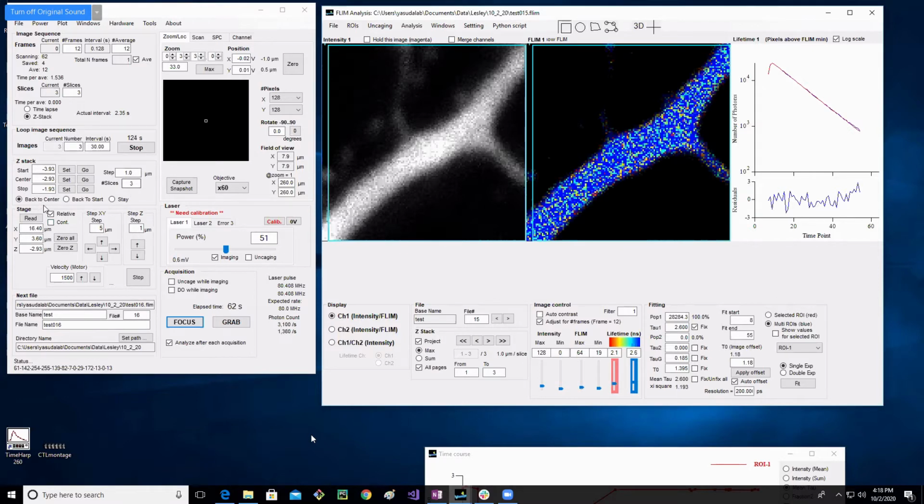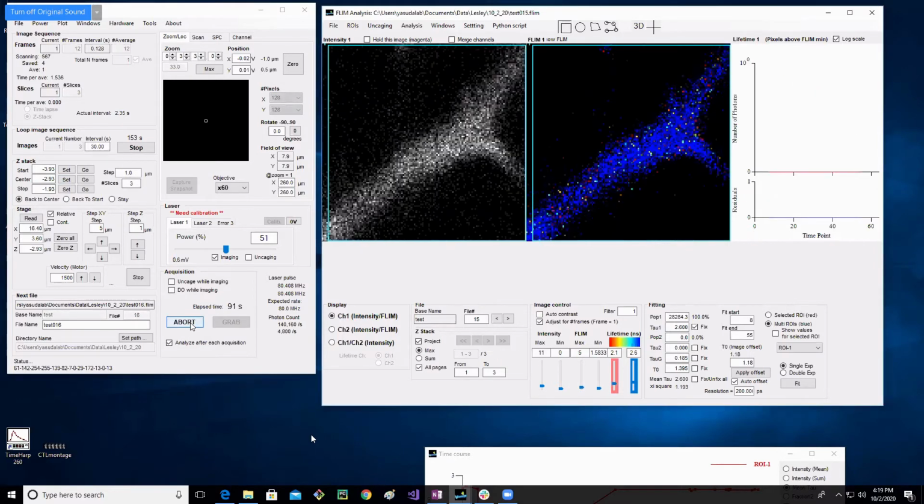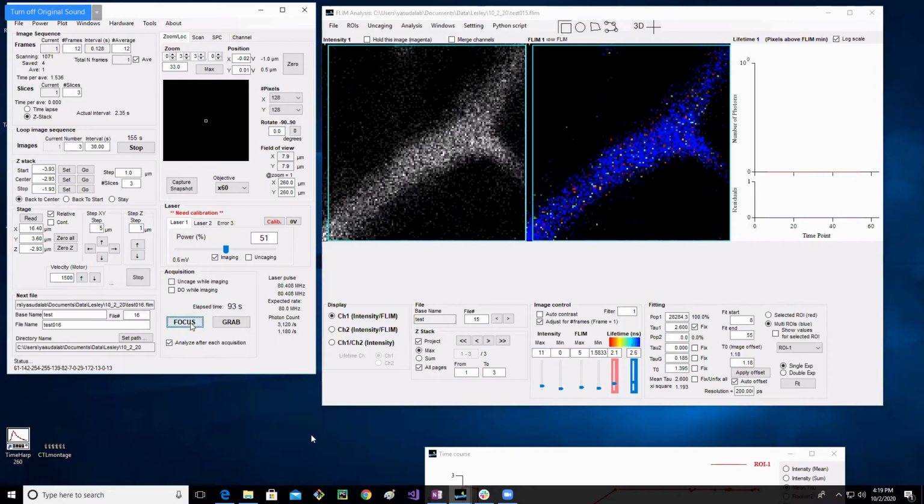So these stacks, I have a question. When you start doing the Z-stack imaging, do you set the stage first? Like, there is this option of reading the stage values. Do you set that before you start imaging? There's been a bug in one of the softwares, which I think is mostly fixed now. If you focus it, it should be automatically detected for the center.